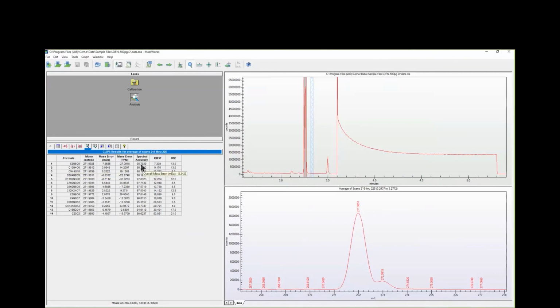And you'll see that in this list it goes from 90 to 98.7, which isn't bad. If you look at the last match on the list, and this is the mass error, just because the mass error is smaller doesn't mean that that particular compound is a more likely candidate.